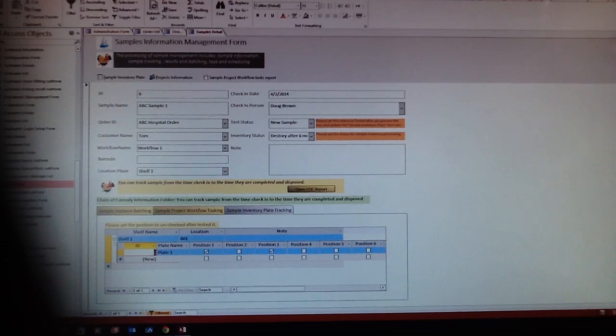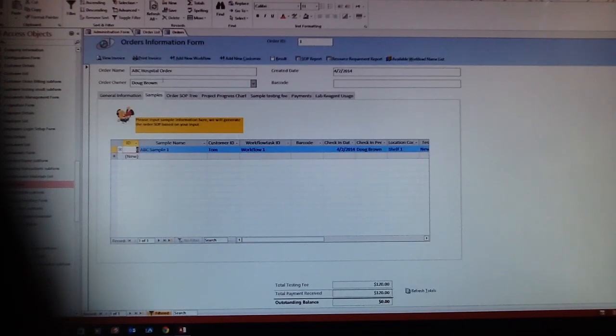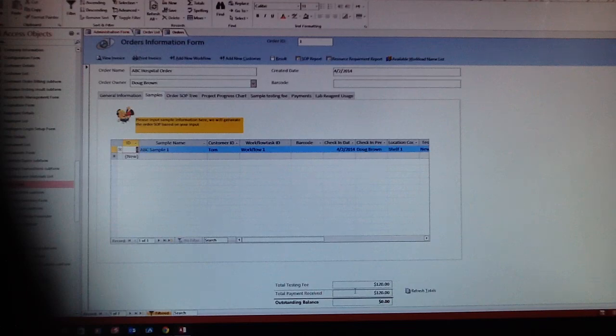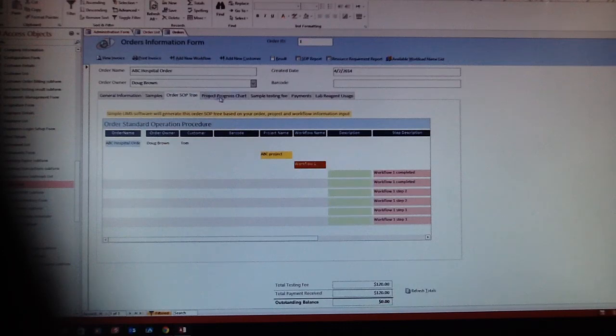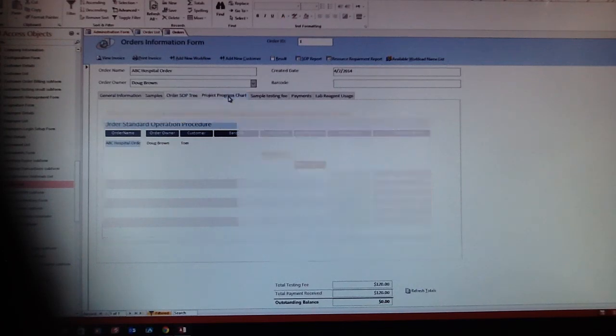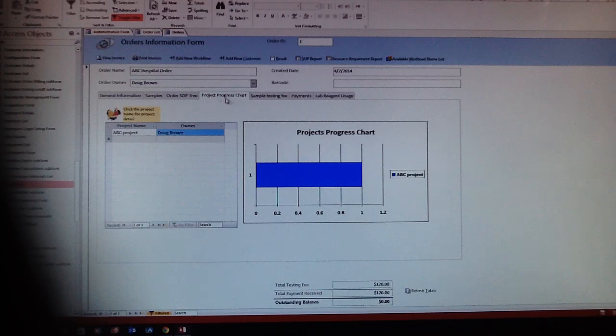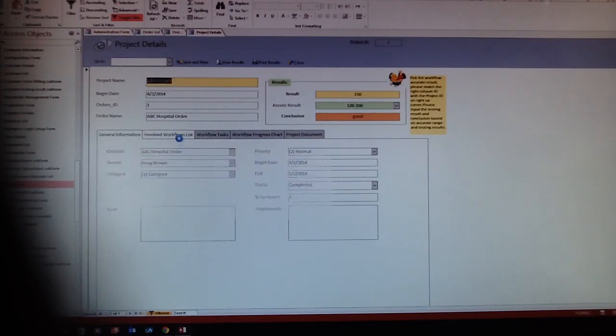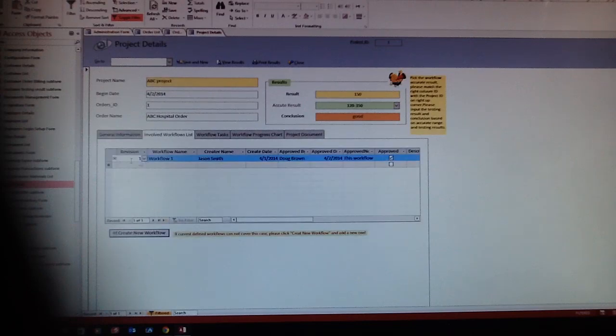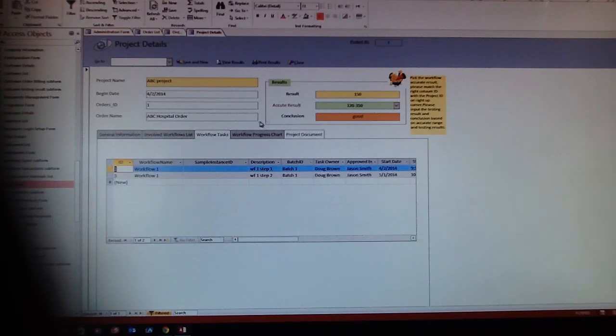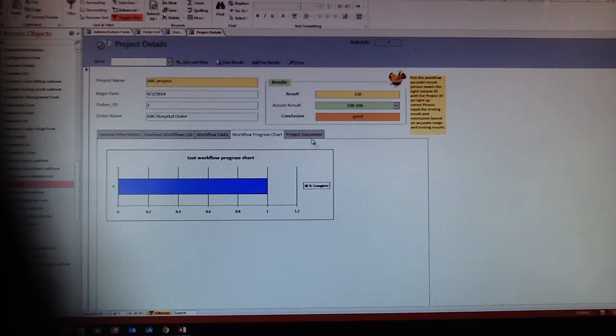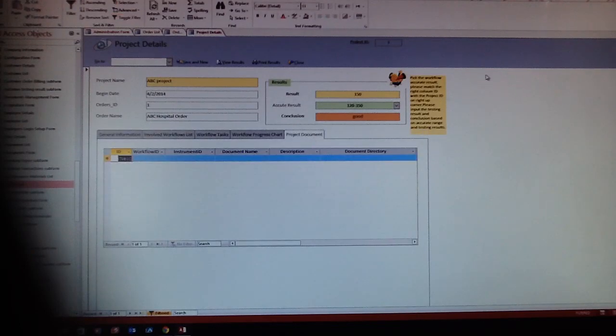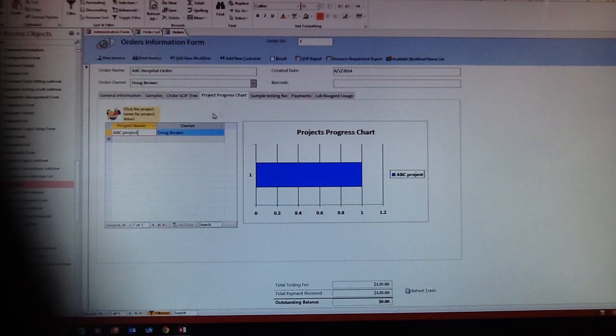Here is the workflow things, the order things. Here's the overall order status, the testing fee and total payment received. And here's the order SOP tree and the project progress chart. It's the ABC project, and then ABC project involves workflow, workflow tasks, workflow progress, and project documents.